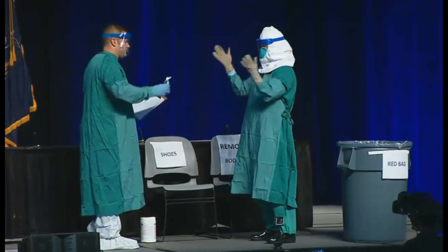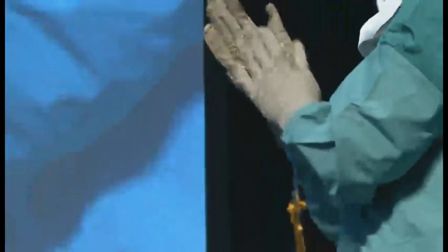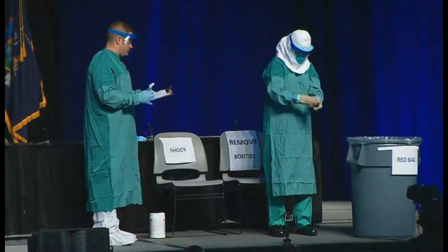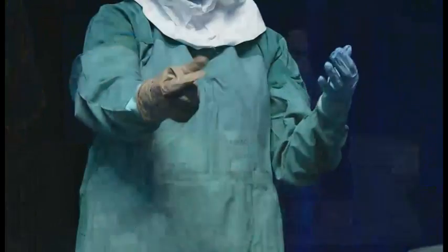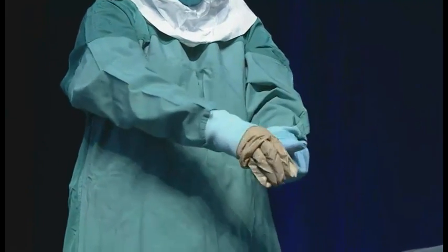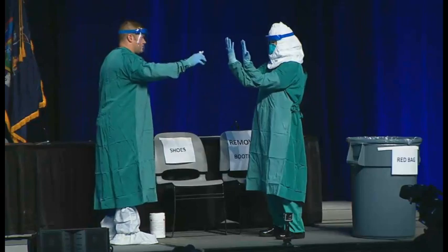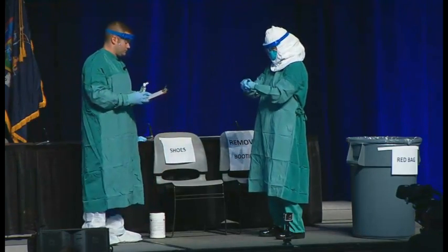Next, she's going to disinfect and remove her outer gloves. After removing the shoe covers, she stood and had Brian watch to make sure there was no evidence of contamination — careful observation after each step of removing. She's carefully inserting the clean inner glove hand underneath the glove to make sure she does not contaminate the other gloved hand. Now we're going to inspect the inner gloves for any visible contamination, cuts, or tears, and then perform hand hygiene.